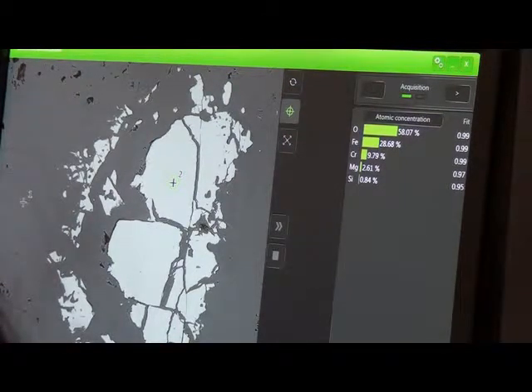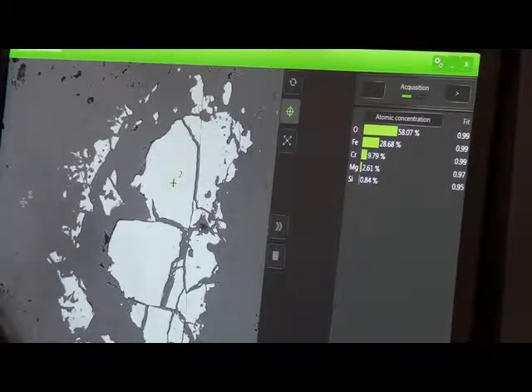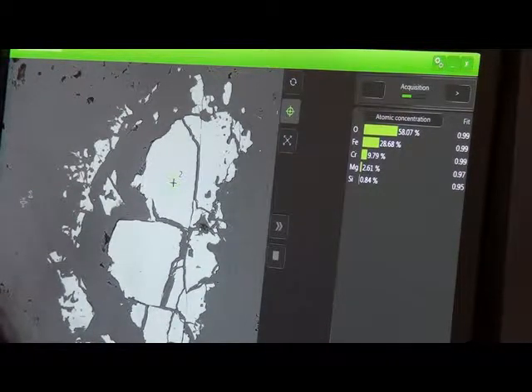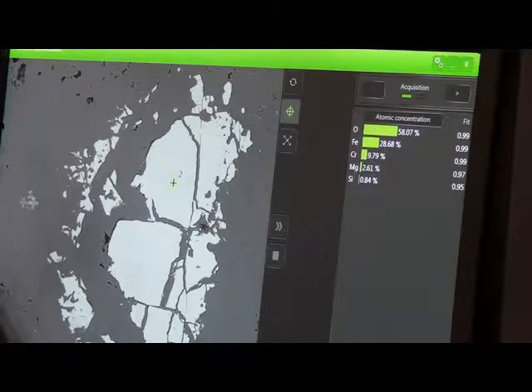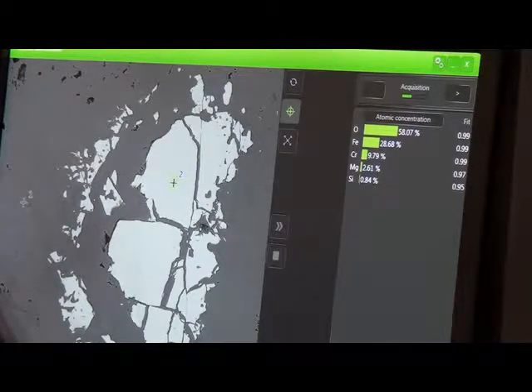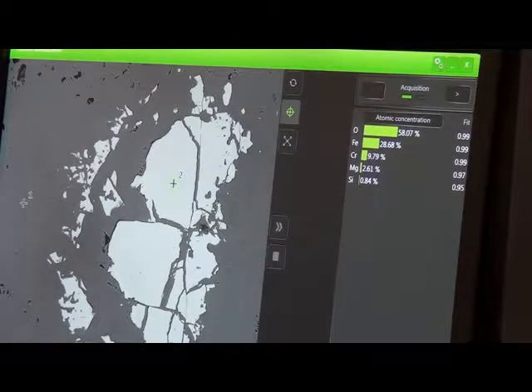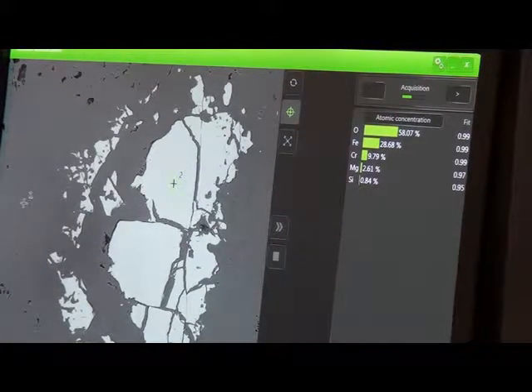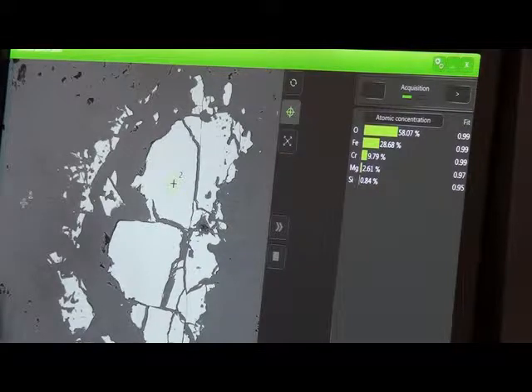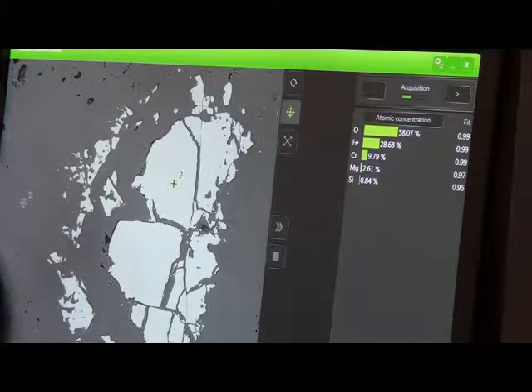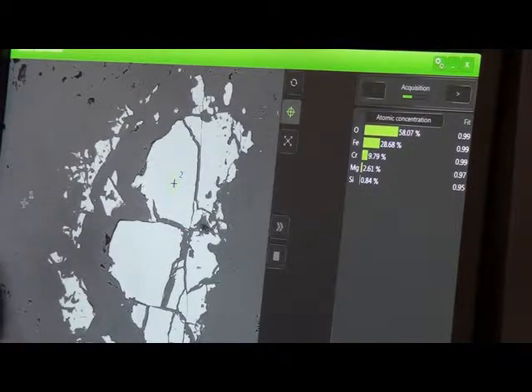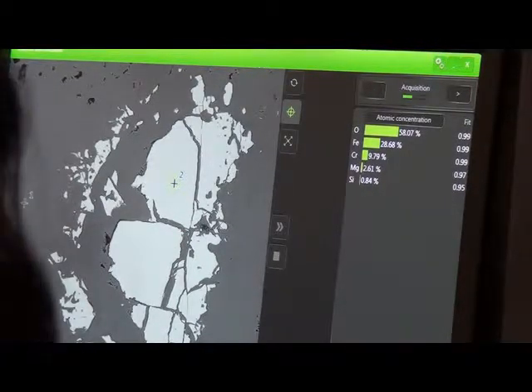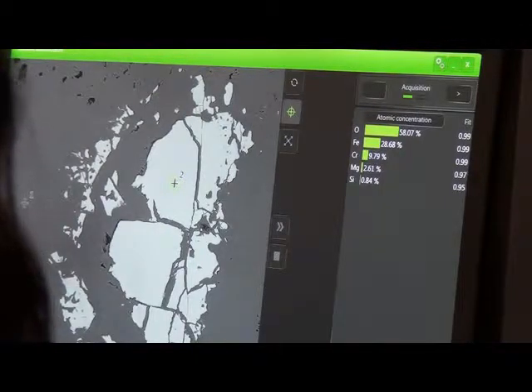What else is present in this? Chromium. Chromium, right. And in fact, you probably might even have called this a chromite or some similar term. It's really an alloy of iron and chromium that's been oxidized is how a chemist might think of this.